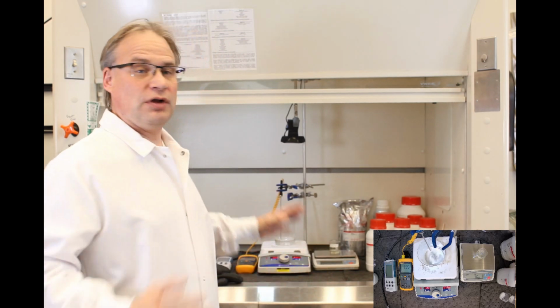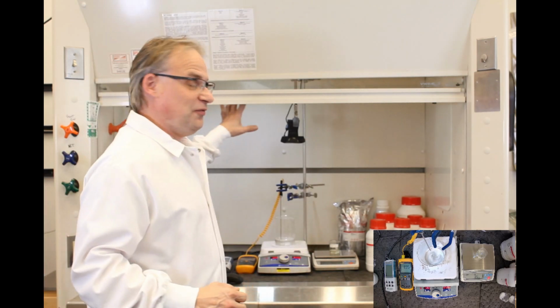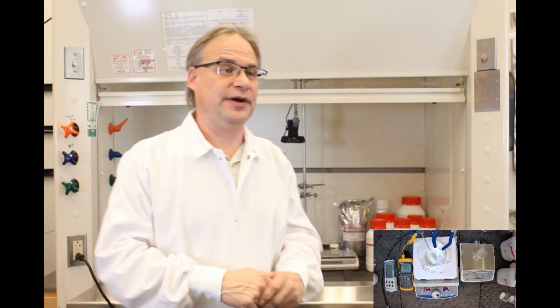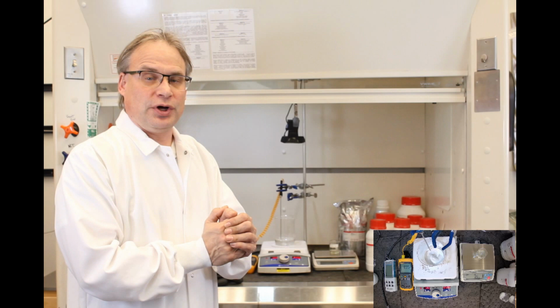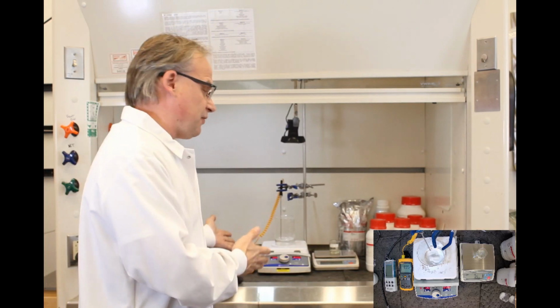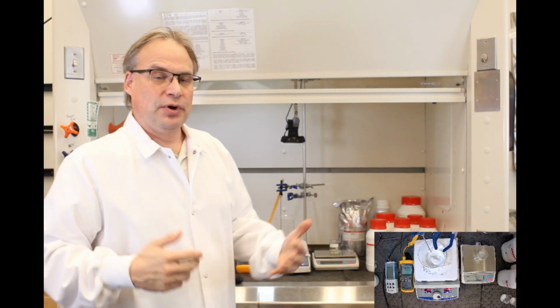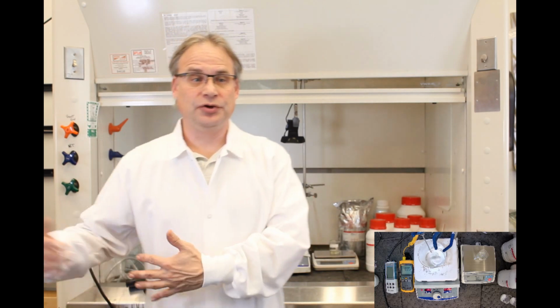We set up fume hood cams and the central cams for all of our videos. In our production side, when we go over there, you'll be seeing large glass reactors, anything from a few milliliters up to 250 gallons. So we'll be covering production all the way through. But starting with this, we'll start with how do you make your first nicotine salt? I'm going to cover it from a do-it-yourself perspective, and then how we would do it in the lab, and then how you do it in production.